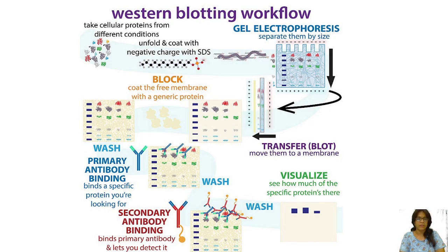So this is the easiest diagram that I can explain. This is the gel, and this gel is electro transferred to the nitrocellulose membrane, and there you get different bands. In this sample the primary antibody is added, the one suitable for your protein of interest.